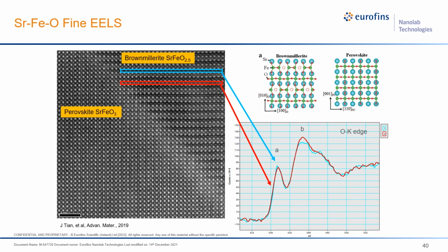And also note that these two spectra are extracted from these two single atom layers. So this is just an example, but you can see how EELS can be used to understand chemical species difference in single atom planar features such as stacking faults or dislocations.